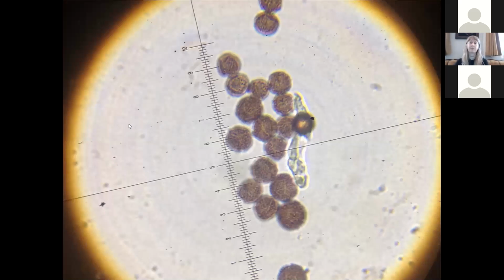And if you are measuring for science, you're supposed to measure around 30 spores because they can vary a little bit in size. And you're also supposed to drop the very highest and lowest ones because they're weird outliers. I usually measure like 10 or so. It's tedious to measure a lot of them, but it depends on how much you care about your specimen.